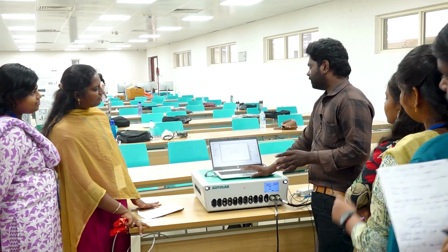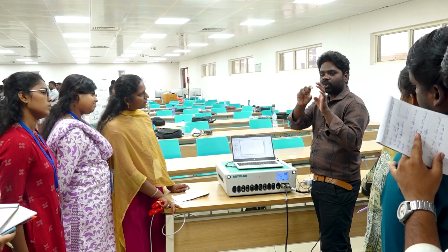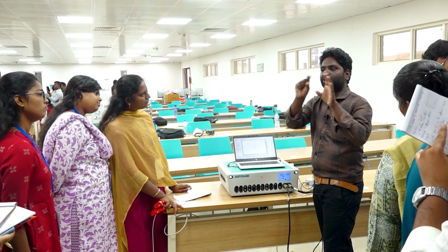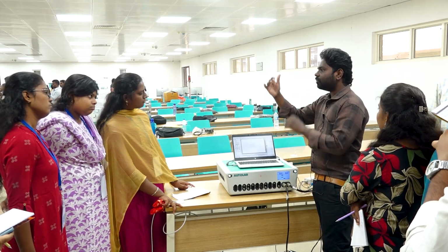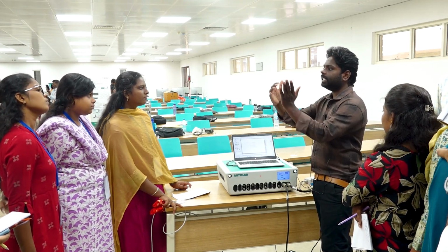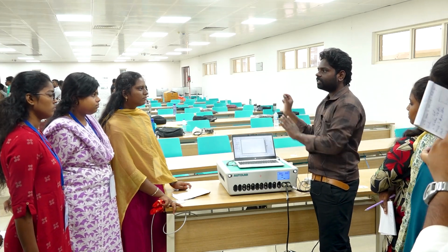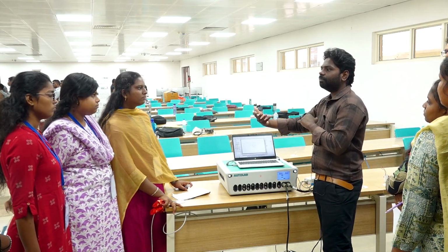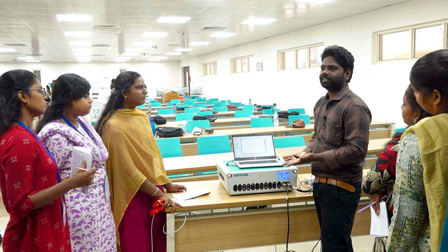So the thing is, there is a pattern. We cannot directly put all the elements one after another. There is a strong concept behind this: why we are making a circuit in series and parallel. We should know this, then only we can make a circuit. After defining the circuit, then only we can get the exact values.